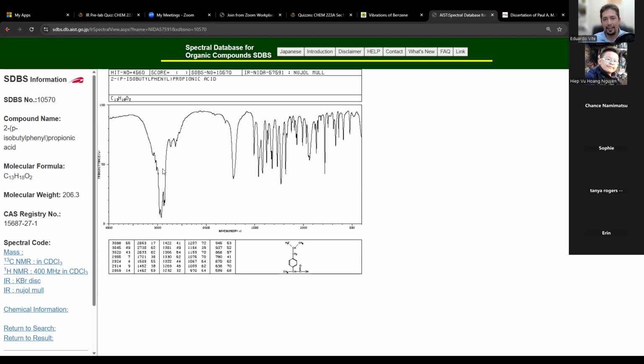So yeah, it doesn't always look like the examples. The examples are the simple situations that we show you. This is why I'm encouraging you to go look up your own molecules so that you can get some practice. We look at it and then we justify it. So for example, there's a carboxylic acid in here. Where's the carbonyl of the carboxylic acid? Where is that in the spectrum here? Where's this carbonyl? Right here, this one. Where is that located in the spectrum?